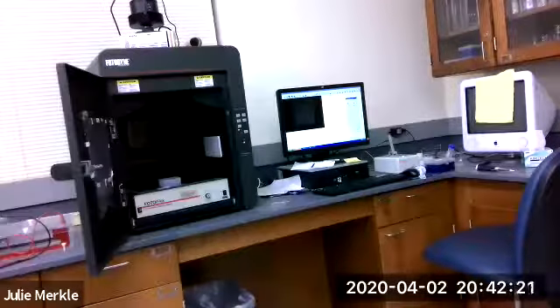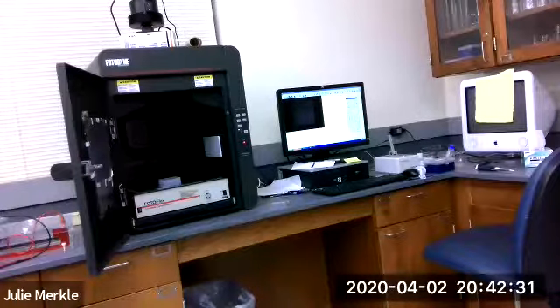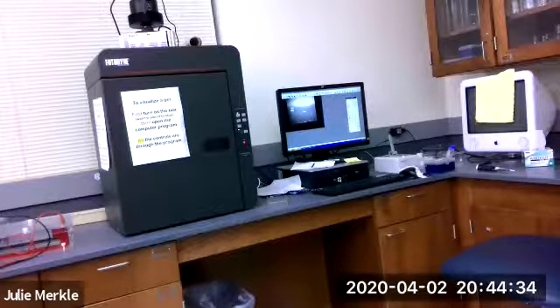So this is what the transilluminator looks like when the door is opened and the gel is inside. And I'm going to shut that and start the imaging on the computer that you see on the other side of the gel box. So I've captured an image of our gel here, and it looks like we have PCR products, which is wonderful. And I will download this file as a TIFF file so that you can look at it on your computer and incorporate it into your lab report.